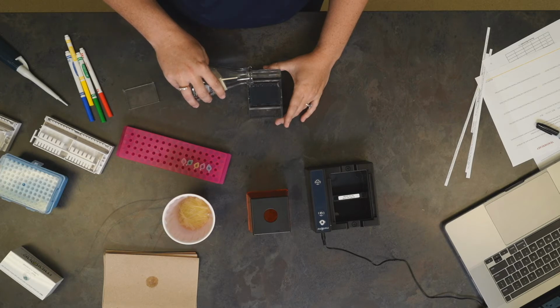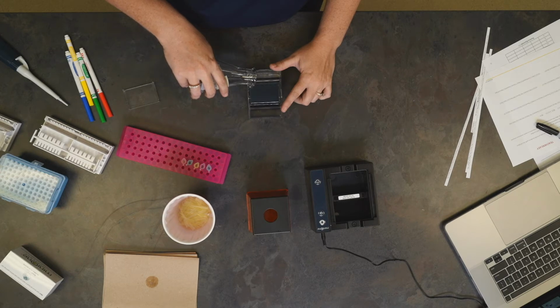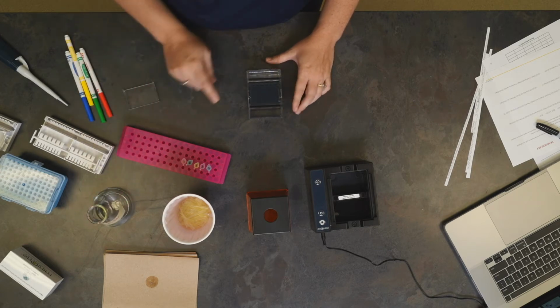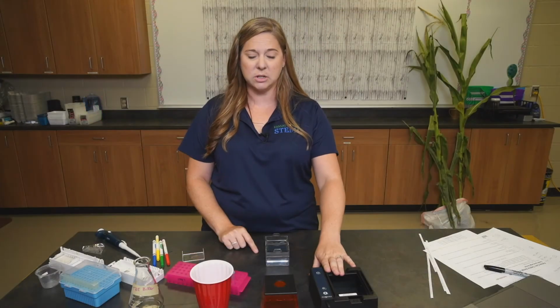We want that buffer to move its way all the way across and completely cover the gel. Right now it's covered the top of the gel, but it's also percolating into the other side of the tank. And I want both sides of the tank full, as well as a very thin layer on top of the gel. Now that I have that accomplished, I'm ready to go ahead and put this into the carriage.